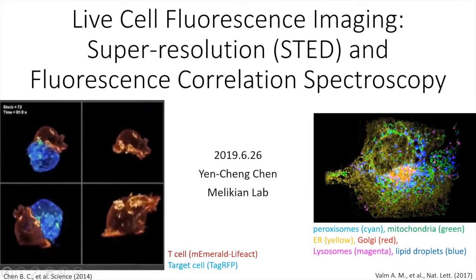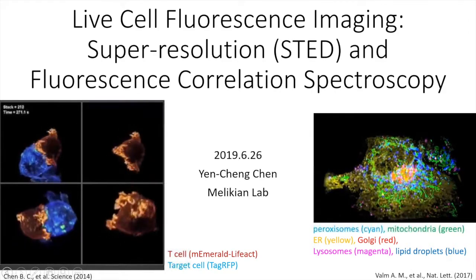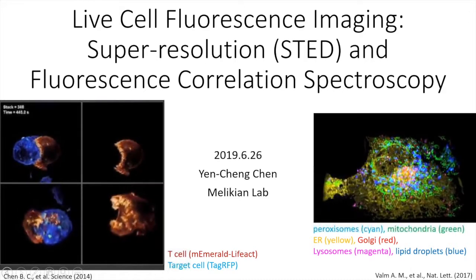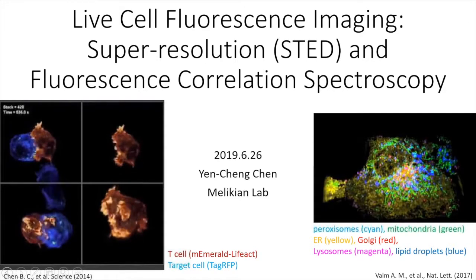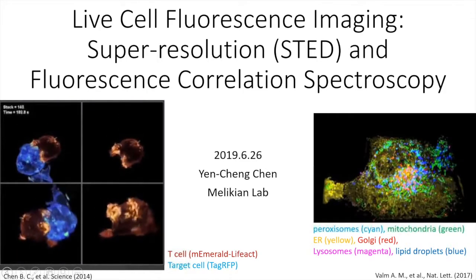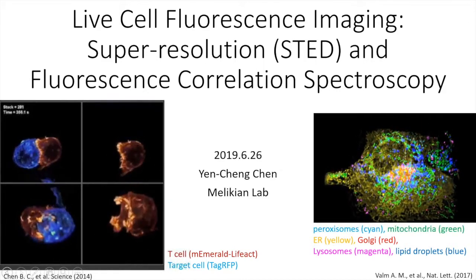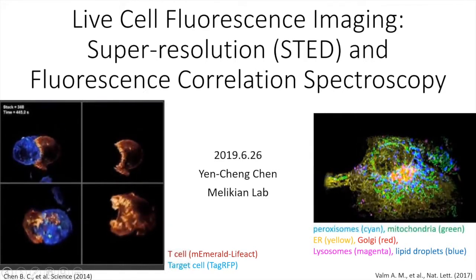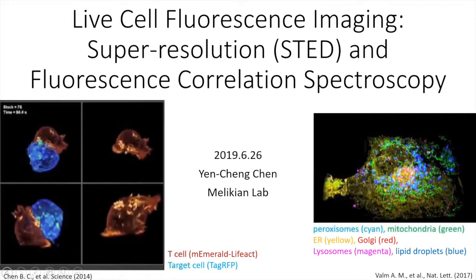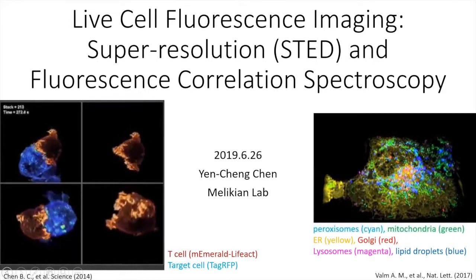So today, thanks for the introduction of all the techniques. Today I'm going to talk more in-depth about super resolution and also correlation spectroscopy. My idea is just to show you amazing images and then pull you back to reality by telling you the practical aspects of each technique. I'm not the expert for each technique, but I will try to go through the big points from my hands-on experience to tell you what you need to be aware of.